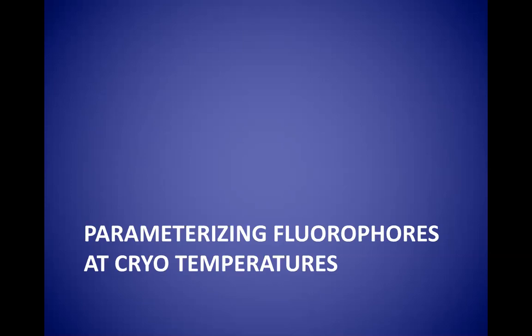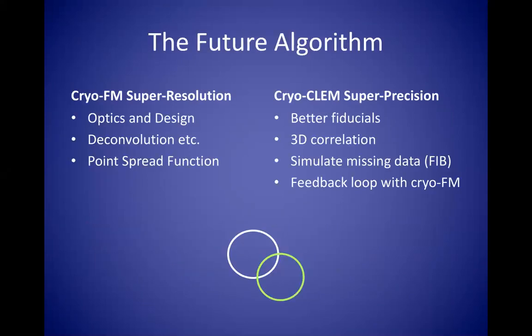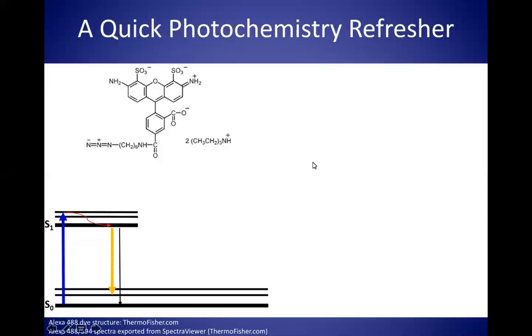So moving on to some new developments. One of the projects I've been involved in has been parameterizing fluorophores at cryo temperatures. So in the super resolution side of things, it would be included in the optics and design. So this is going to require just a little bit of photochemistry, so bear with me. This is my favorite fluorophore.